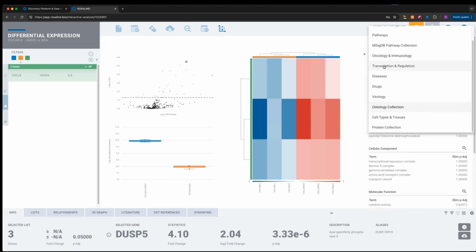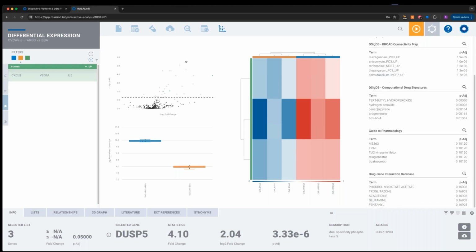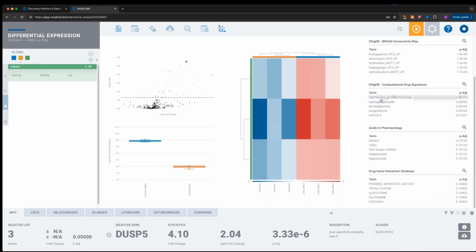I don't have time to go through all of the data, of course, but I'll show you a couple other highlights. We have this drugs category, which for me is really interesting because I have a background in drug development. So if we were studying potentially a new compound or a new molecule, and we didn't fully understand its mechanism of action, we could come to these drug databases and say, well, these known compounds have a similar gene signature, so they are significantly enriched in this case.